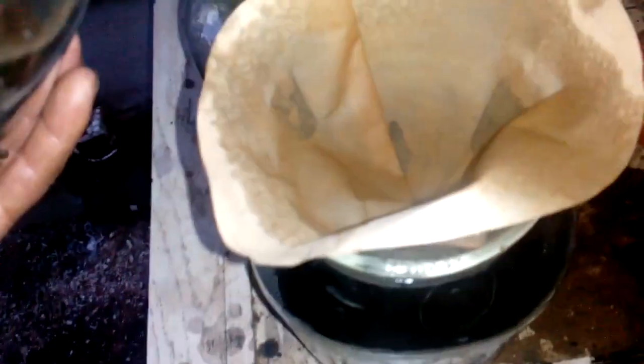Okay guys, I decanted all the extra solution. After one hour, we got our gold — see that? This is our gold. Now I want to run that through a filter and see how much we got.